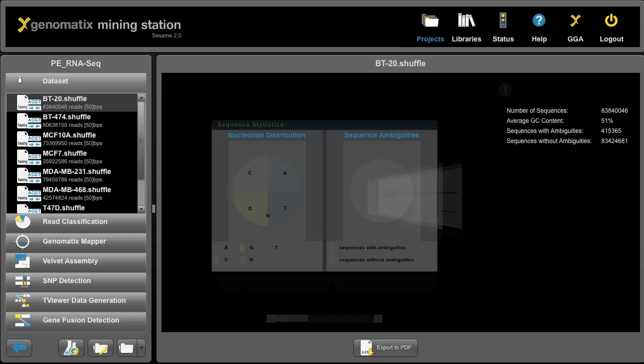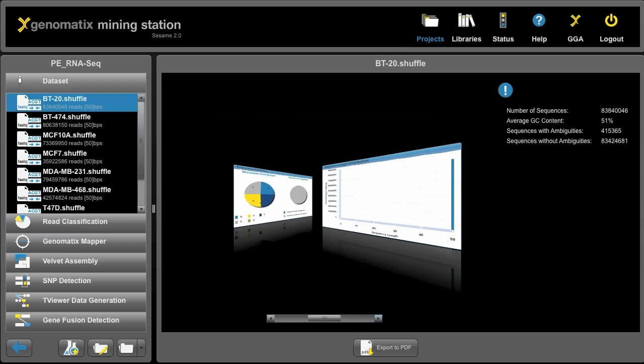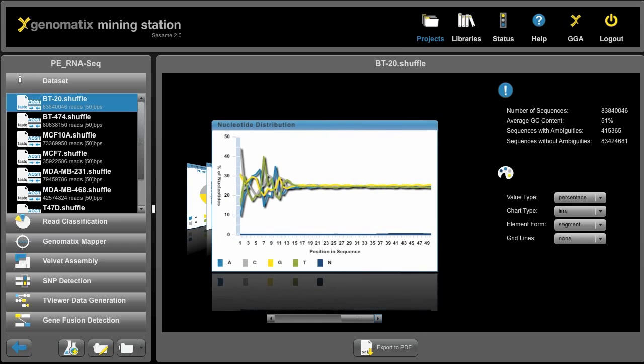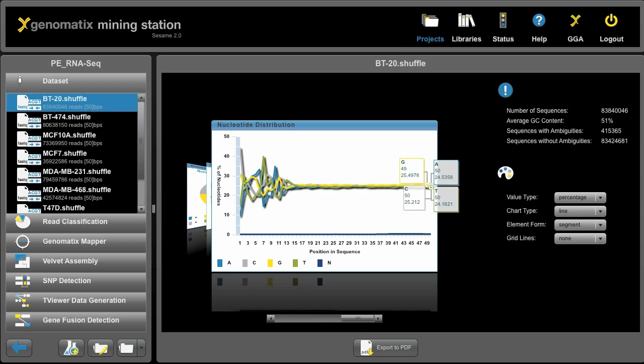If we click on any of these files, we get statistics about the reads like the nucleotide distributions or the sequence length distribution or the nucleotide distribution along the read. Now what you see here is an effect of the random hexamer priming and to the end it averages out, which is perfectly fine and what we would expect for RNA sequencing data.